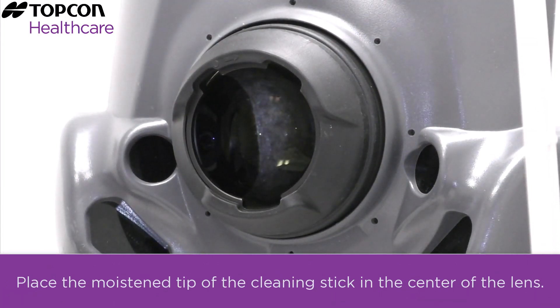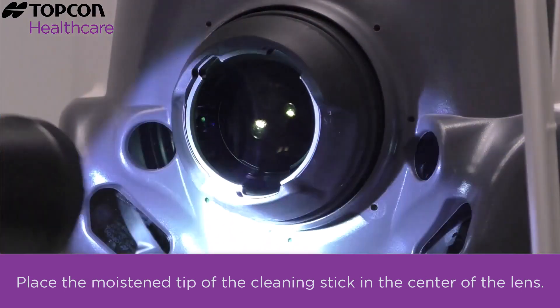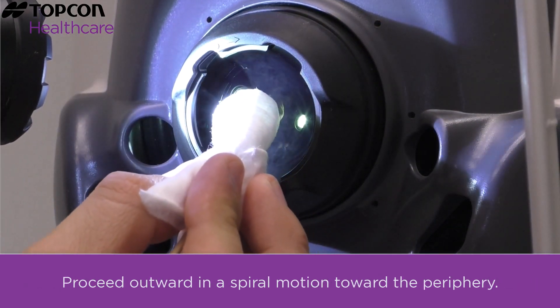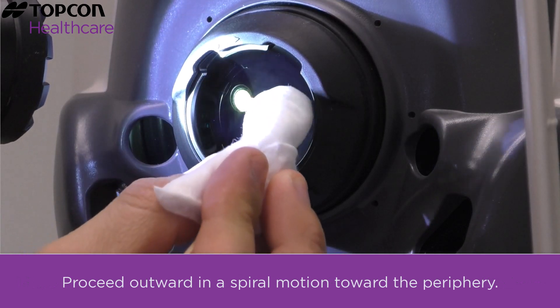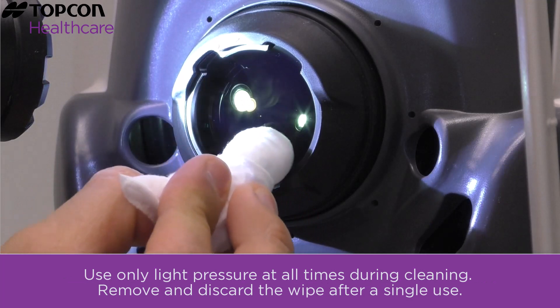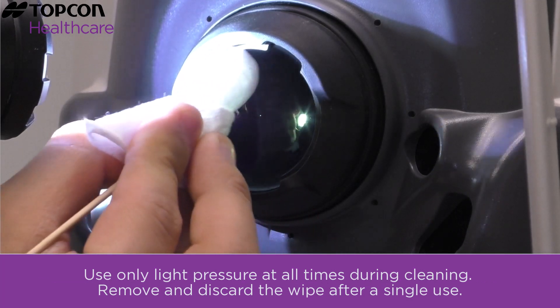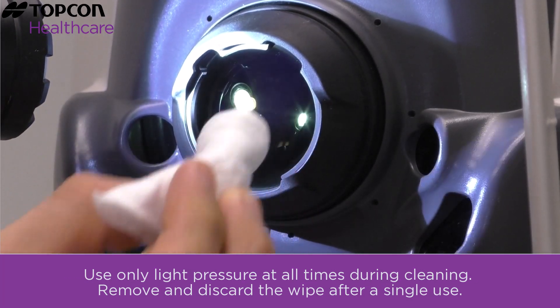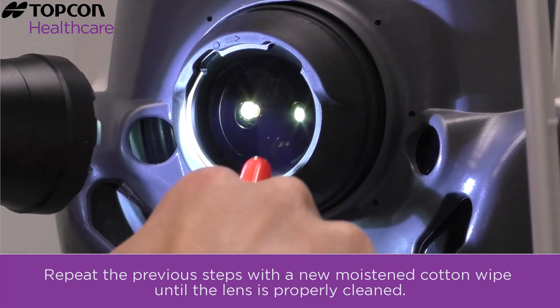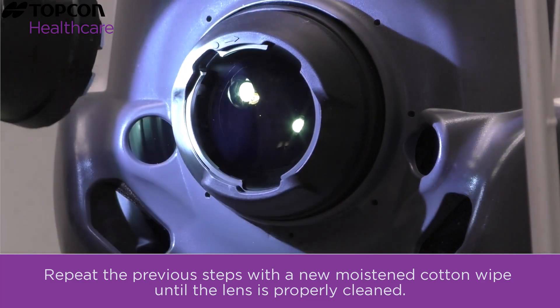Place the moistened tip of the cleaning stick in the center of the lens. Proceed outward in a spiral motion to the periphery. Use only light pressure at all times during cleaning. Remove and discard the wipe after a single use.